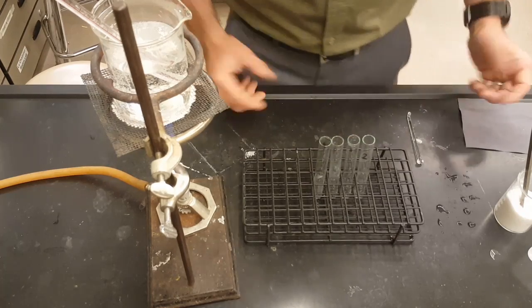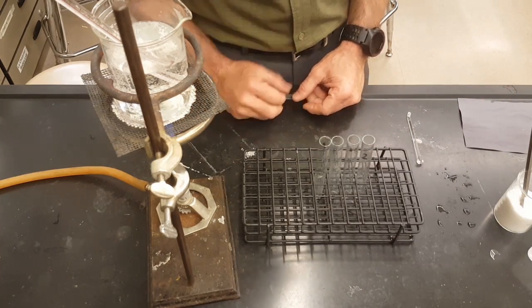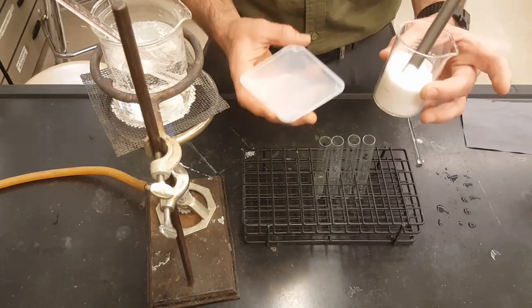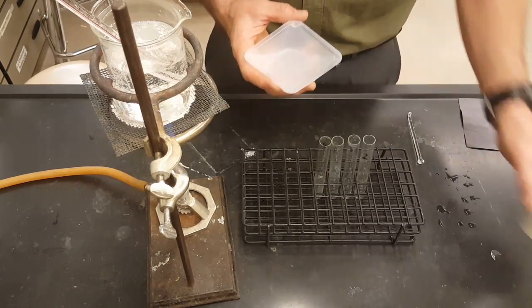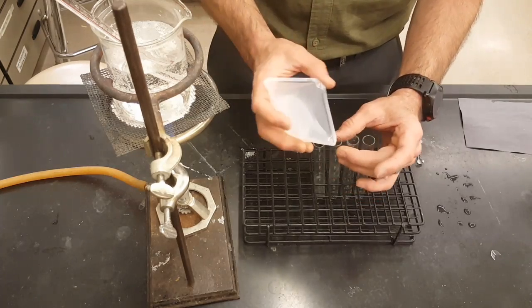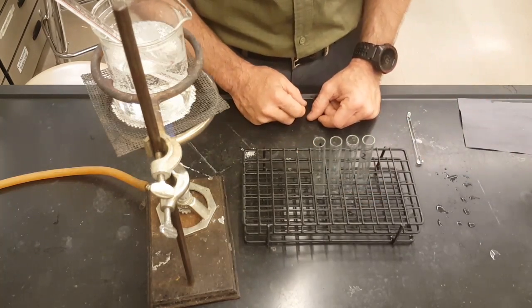Step 1. And it says this in the lab in case you don't remember what the video said. Weigh out 2, 4, 6, and 8 grams of potassium nitrate, and you'll put them in your 4 test tubes. So 2, and then 4, and then 6, and then 8 grams of the potassium nitrate.